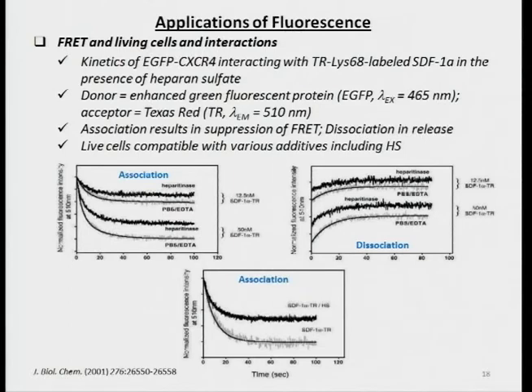You have a donor and you have an acceptor. And what should happen is you are starting from wide apart, and as the molecules come close together, you should basically start seeing suppression of fluorescence, right? That's the quenching, which is exactly opposite to what we saw in the previous case. And then dissociation should basically release it. So what is happening here, and this is time, okay, so this shows time. So in 120 seconds, if you look at the fluorescence intensity, then the intensity is quenched as one would expect because of association in normal buffer.